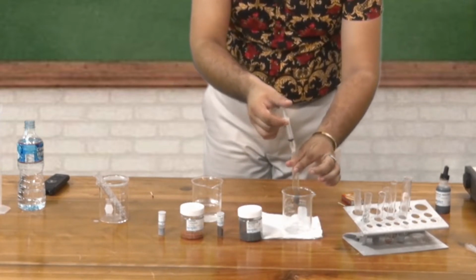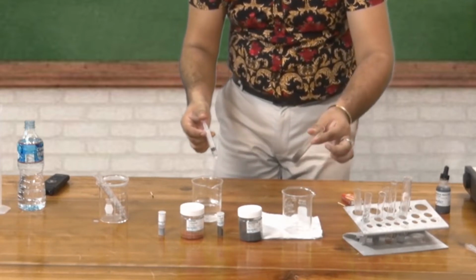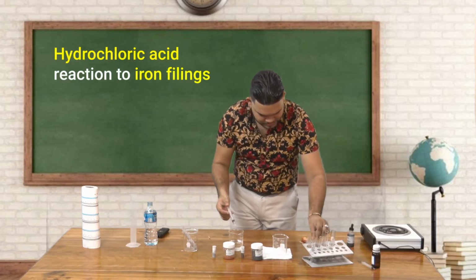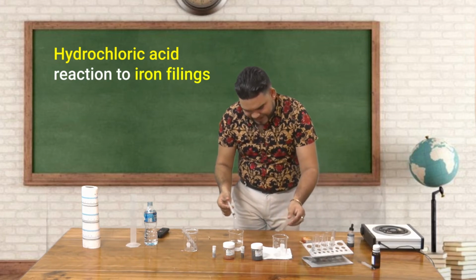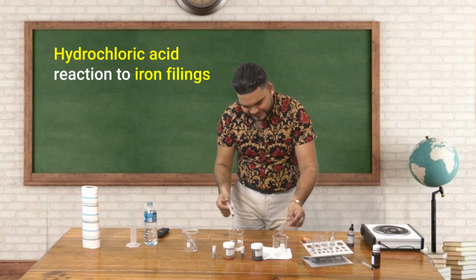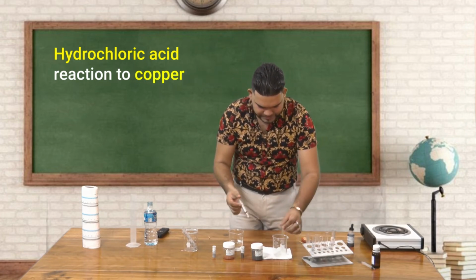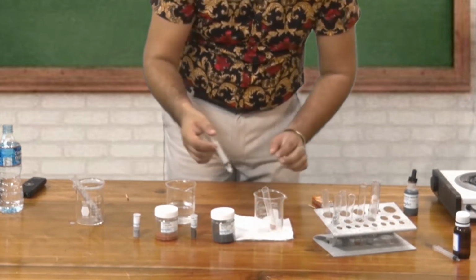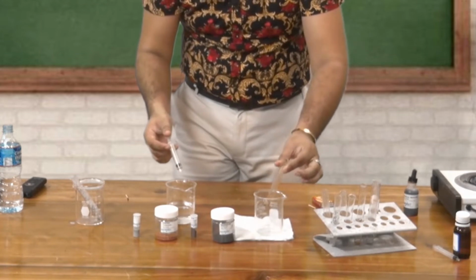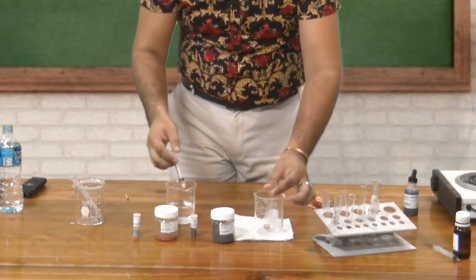So, yeah. Good. Let's go to our, and if I may show you, my magnesium is still reacting. Yeah, let's go to copper. Once again, we have no reaction.